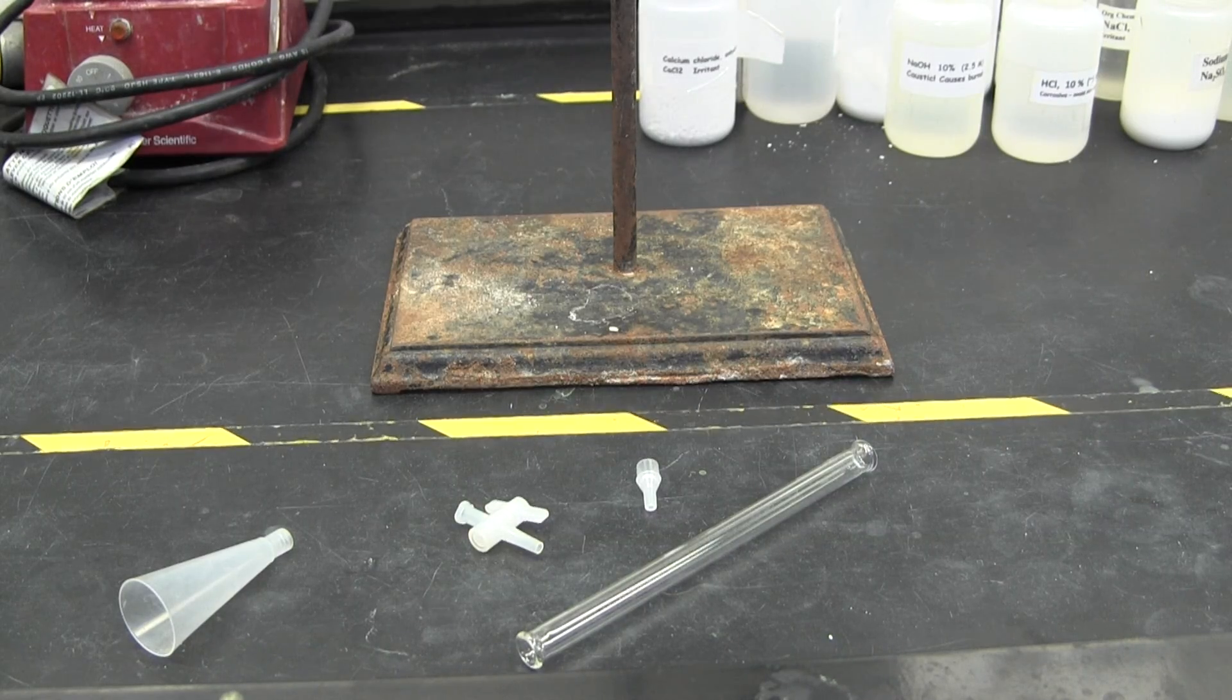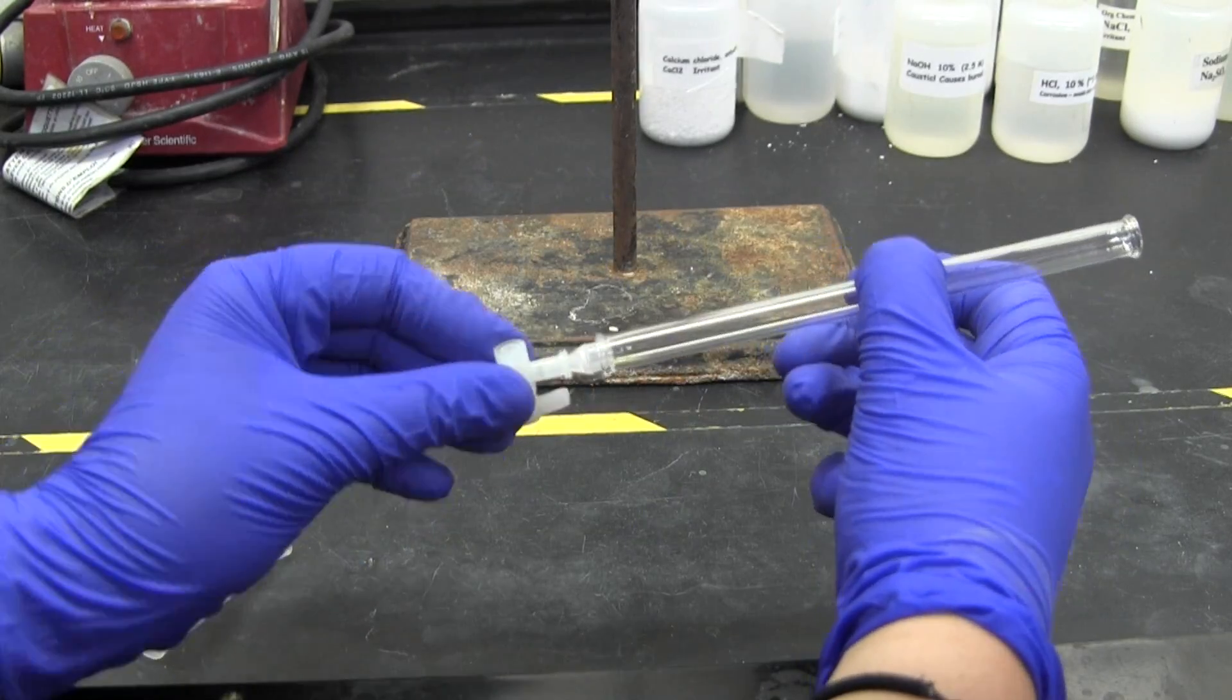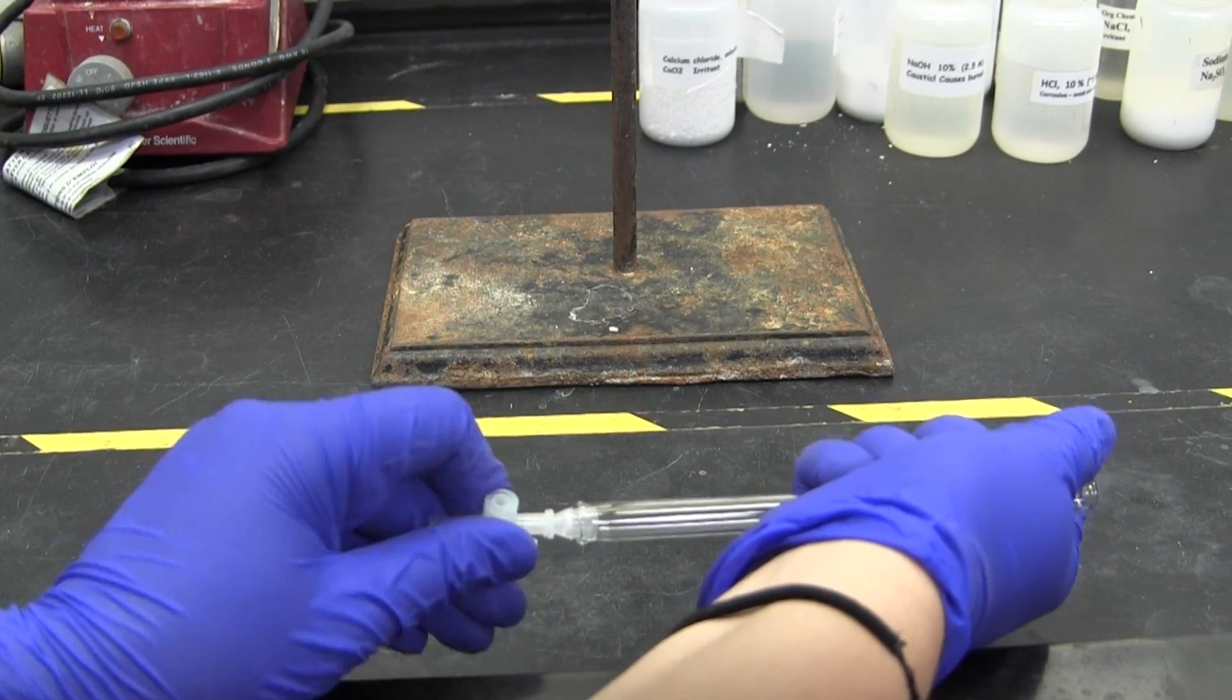You will use the Microscale Kit for this setup. A picture of the proper setup is in your lab binder. Make sure to fit the stopcock tightly into the bottom of your column.